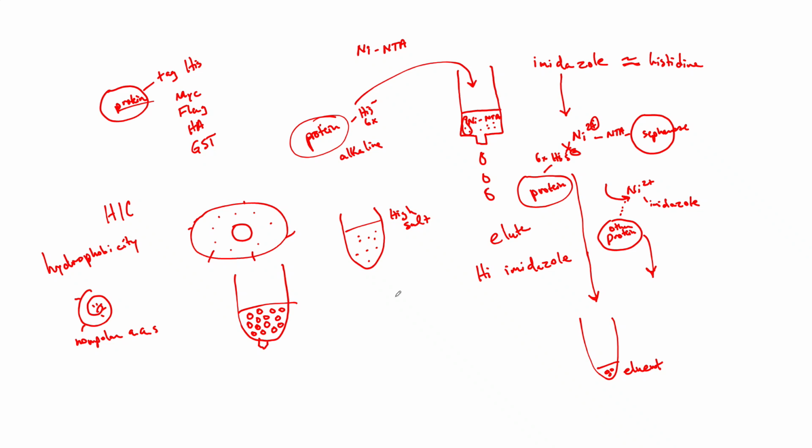And so if you have a protein with some hydrophobic patches here, let's say you have a protein with 1, 2, 3 hydrophobic patches, and you have another protein that has just 2 hydrophobic patches. Well, in salt, if you had a lot of ions floating around in the water, then these hydrophobic proteins are not going to like this at all.